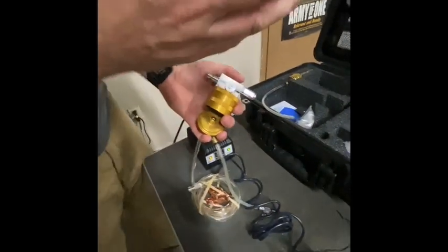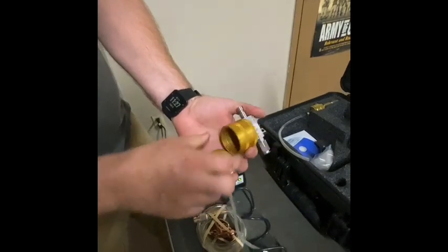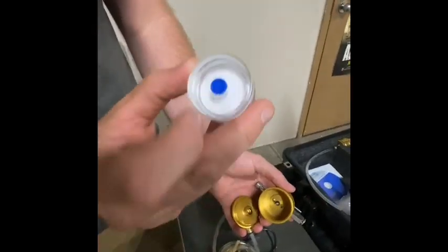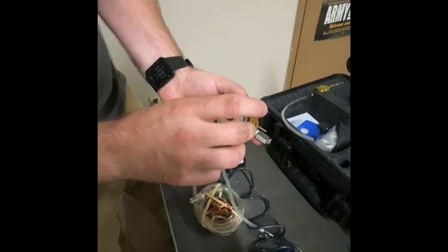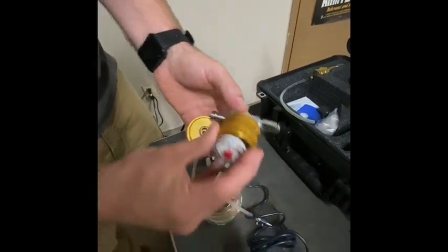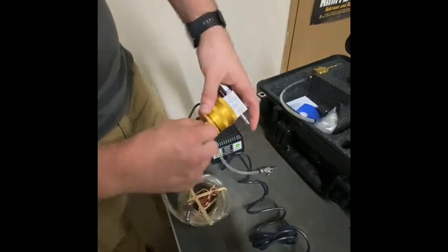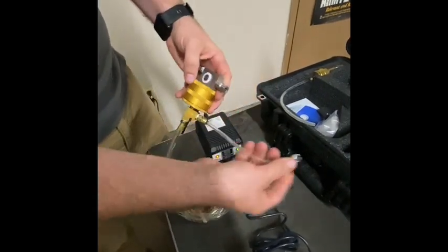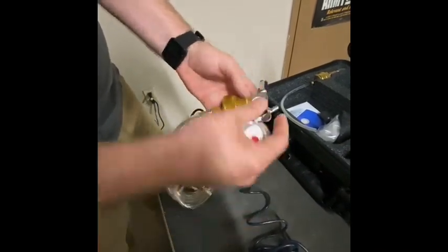You take this testing canister and you place it inside there with the blue cap where it says inlet. I don't know if you can read that. It's facing that direction, because here's your inlet. You close your canister up. Of course, pull off the red cap as well. Reconnect your hose.